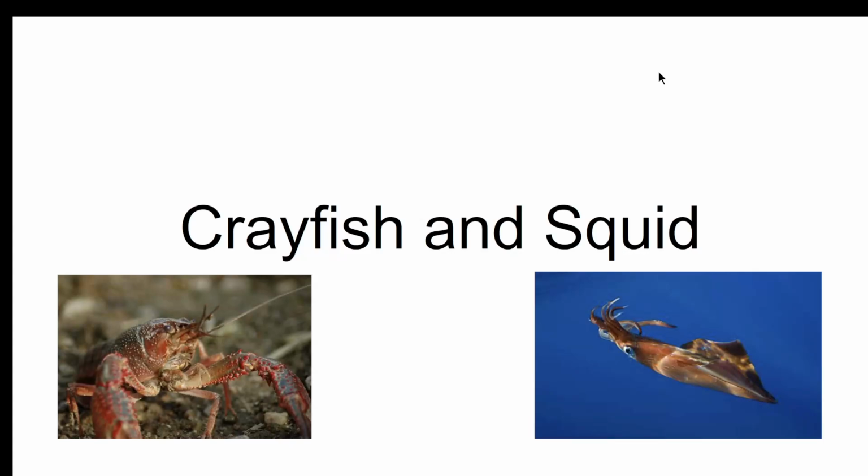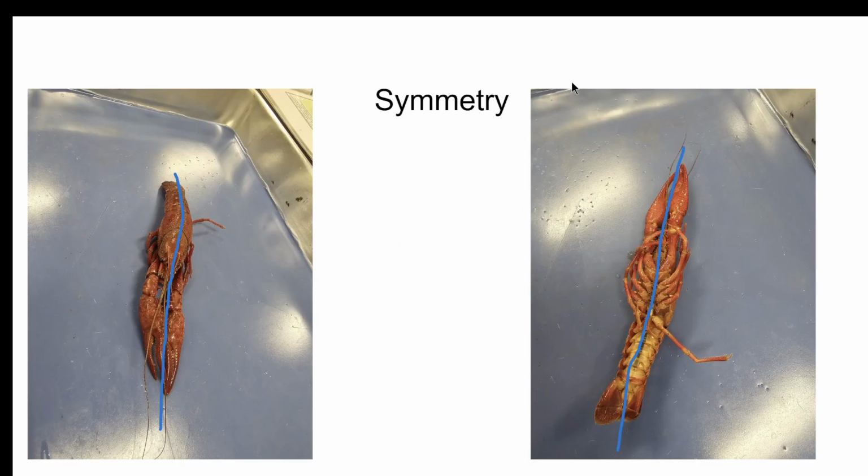Today I will be comparing and contrasting the external and internal structures of the crayfish and squid. So let's start out with the symmetry of these organisms.